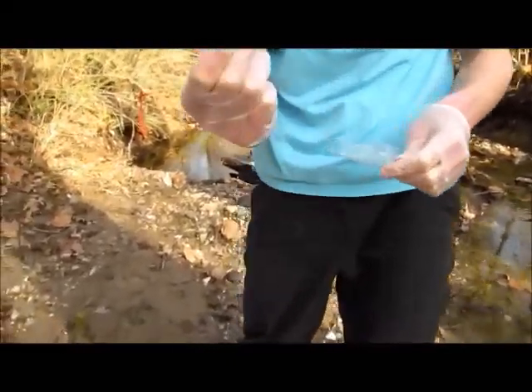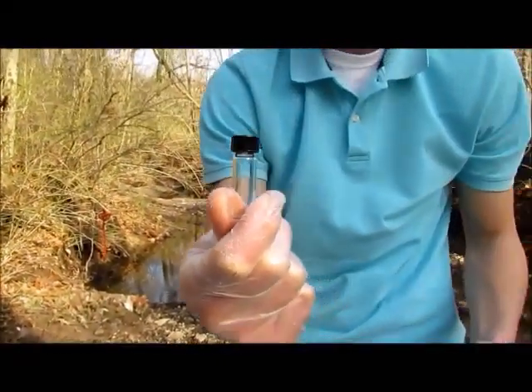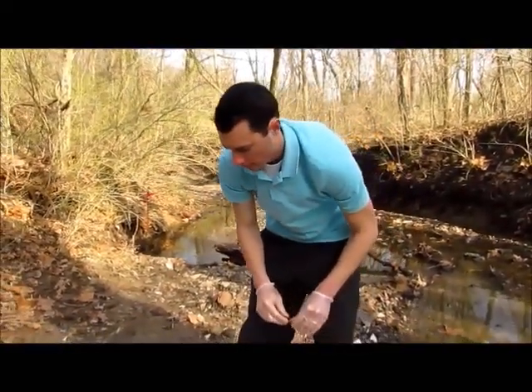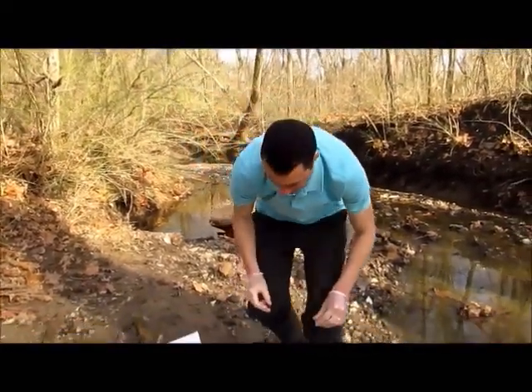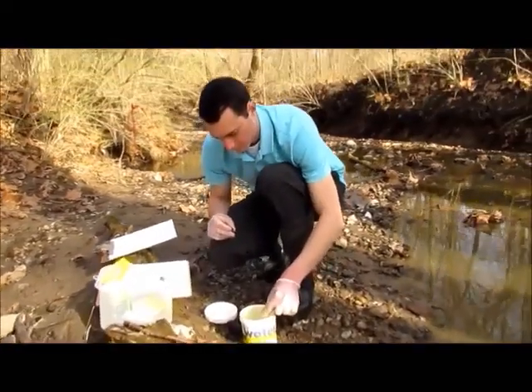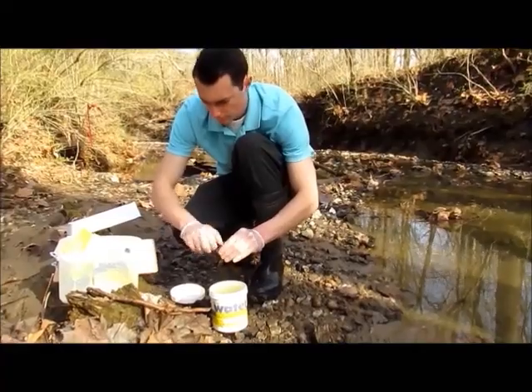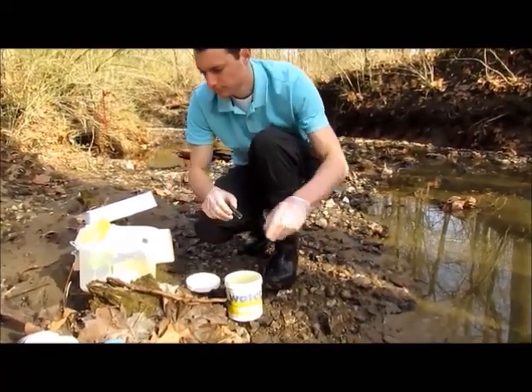You will need a small glass test tube for this. There are two of them in your kit and you will need one for this test. Take the cap off and submerge it in the water, filling it all the way to the top. You want as little air space as possible inside the vial.